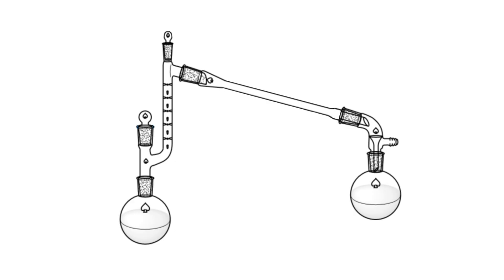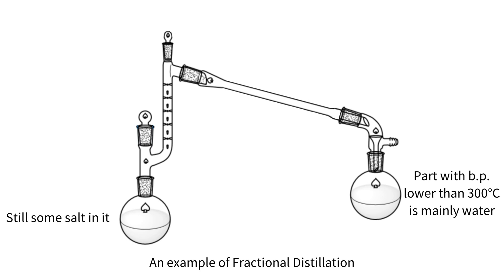And now, to make concentrated sulfuric acid, what I need is fractional distillation. In this procedure, soluble salts that remain in the cleaner and some water will be taken away. Then the concentrated sulfuric acid comes, which in theory has a concentration of 98.5%. But anyway, there's one problem unsolved.